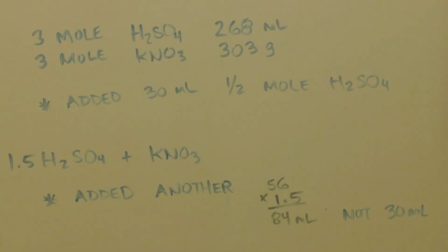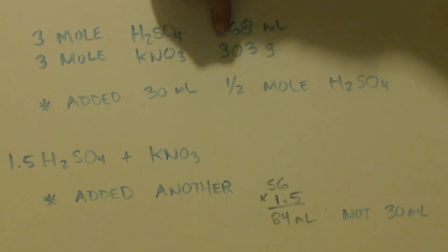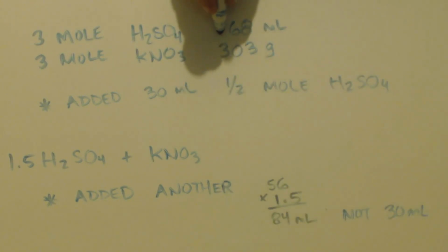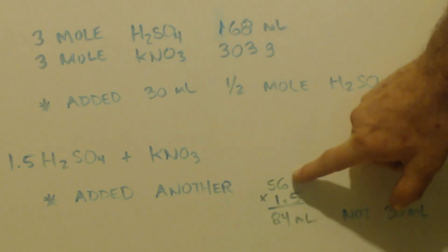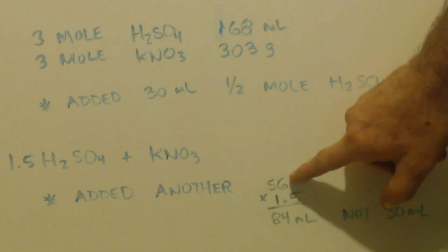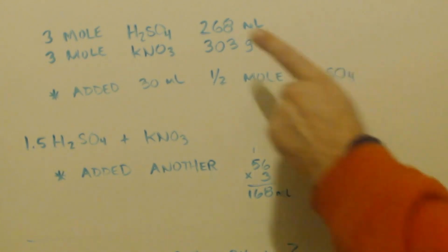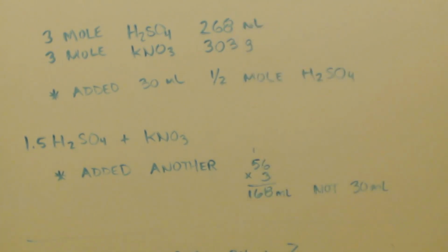Listen, I want you to keep in mind I made a little typo here. This 2 should be a 1. 168, not 268 milliliters, because 56 times 3 is 150 plus 18, 168. And I put in 303 grams and 268 milliliters, not thinking I'm supposed to add in more.